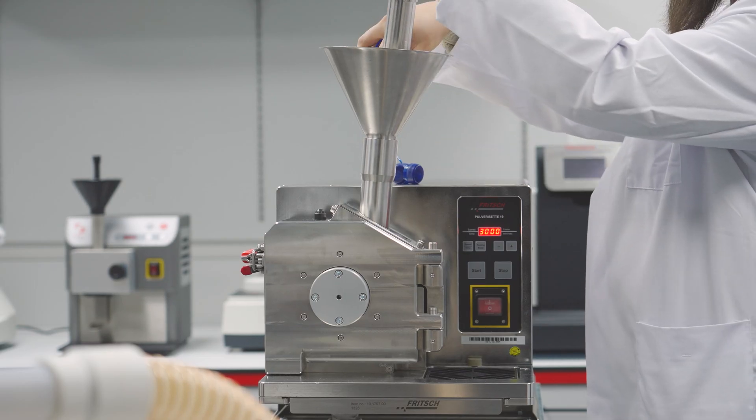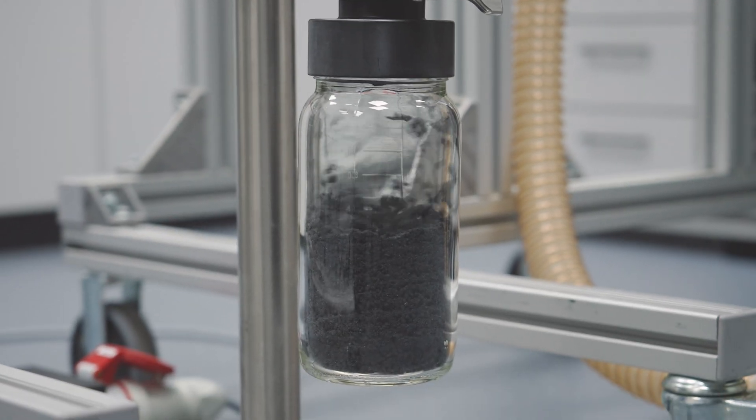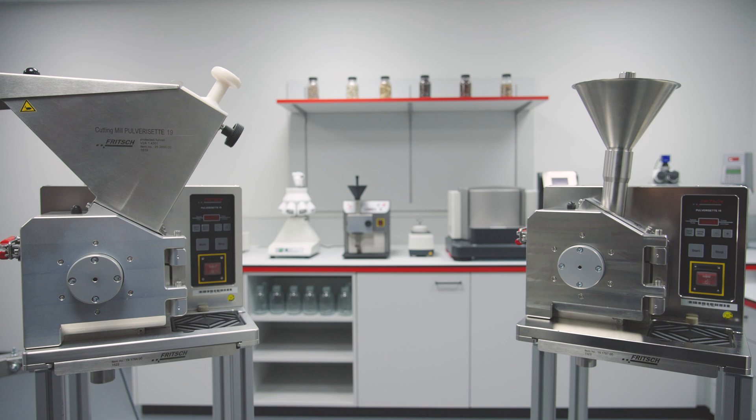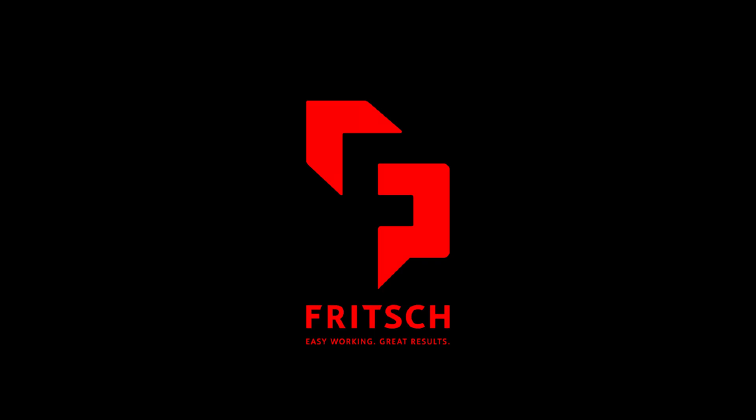Whether plastics, textiles, plant material or construction debris, in recycling, environmental analysis and agriculture or food processing, the P19 offers maximum flexibility with minimal complexity.